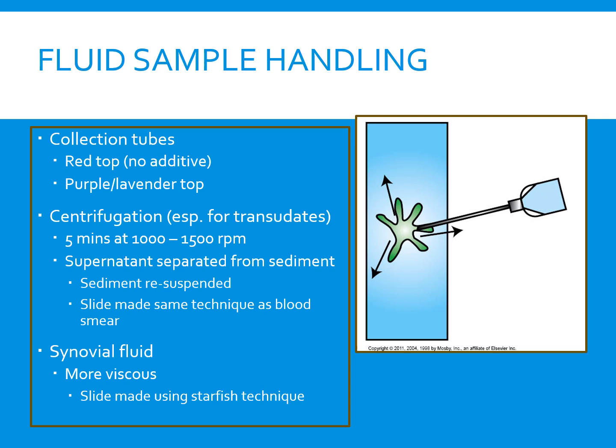Multiple slides, again, are often made when we're sending out to a lab. They do like that you send one stained and one unstained slide, and some may prefer just the fluid without the slides. It really depends on the lab that you're sending it to or who's doing the sample in-house.